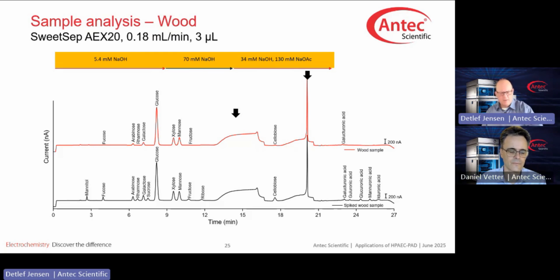It later on stabilizes, but then you have that second peak marked with a black arrow. So what is that? It's basically a similar thing, maybe even identical. But now the hydroxide is not originating from the eluent, but it is released from the column. Why? At the beginning of the chromatogram, we're using hydroxide-based eluents, no acetate. So the column, the anion exchangers, are in the hydroxide form.